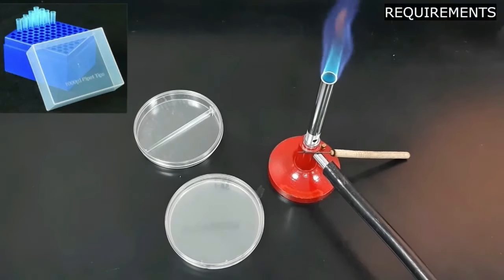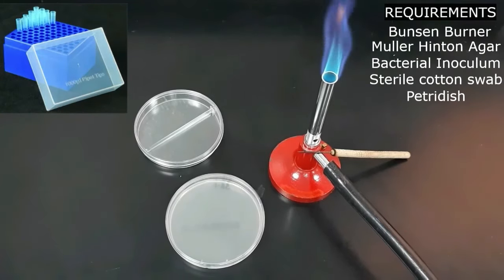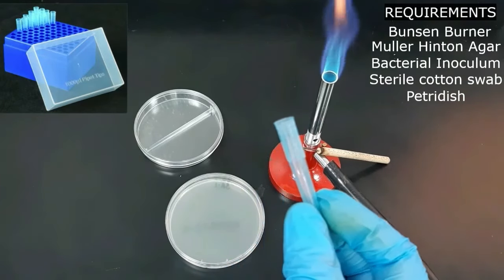To perform the well diffusion assay, first we will see the requirements needed: a Bunsen burner, Muller Hinton agar, petri dishes, a needle, and a blue 1 ml micropipette tip.